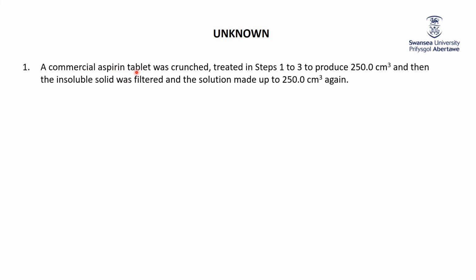So now let's get to the point of this in terms of real life, and let's go ahead and analyze some aspirin. So I went to a store to buy some aspirin. I'm not going to tell you which one. There's no product placement going on here. But anyway, I took one of those tablets. I crunched it up. I treated it as in the original steps 1 to 3. So in other words, I put all the aspirin in it, dissolved as much as I could, put in some sodium hydroxide, and added enough water to make up to 250 cubic centimeters.